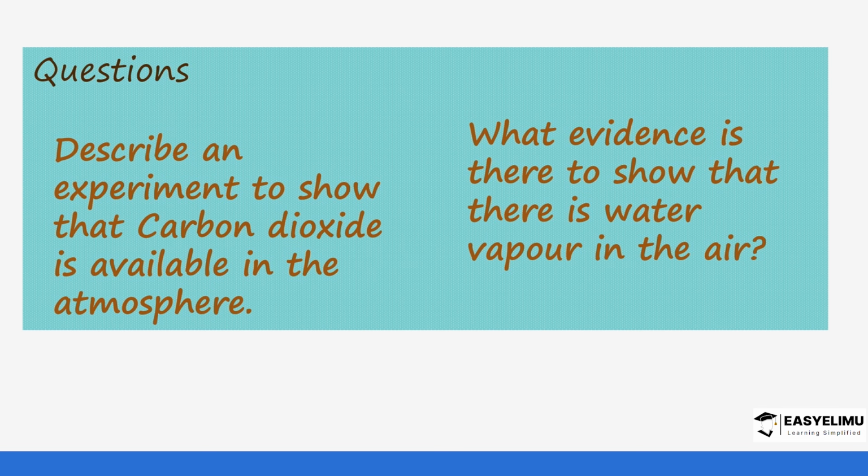So let's look at a few questions to help us to conclude this subtopic on the testing of components of air. Describe an experiment to show that carbon dioxide is available in the atmosphere. So we can use sodium hydroxide pellets.